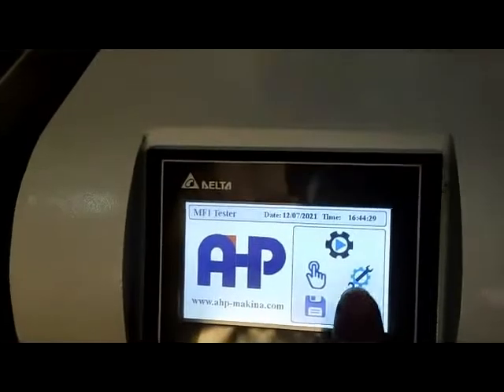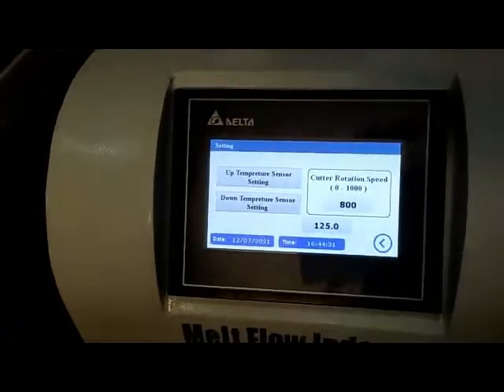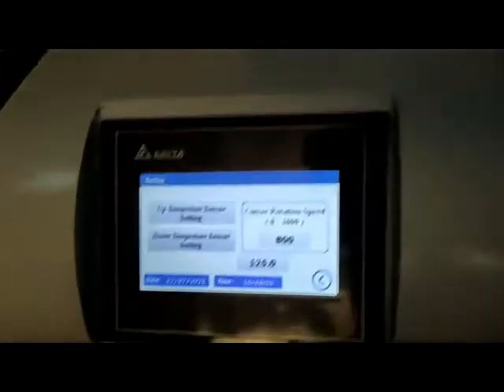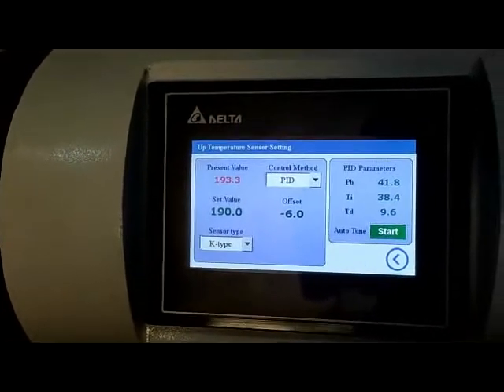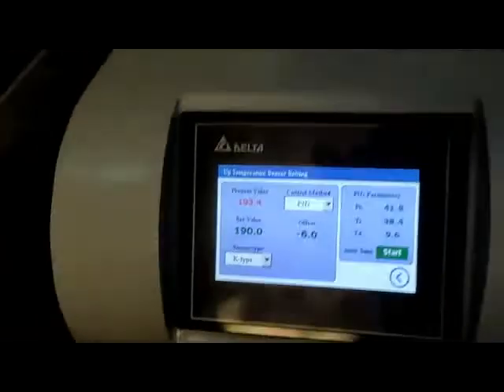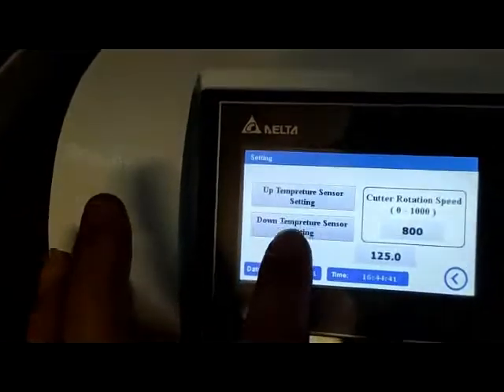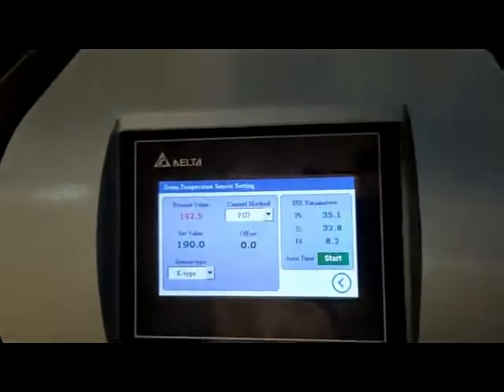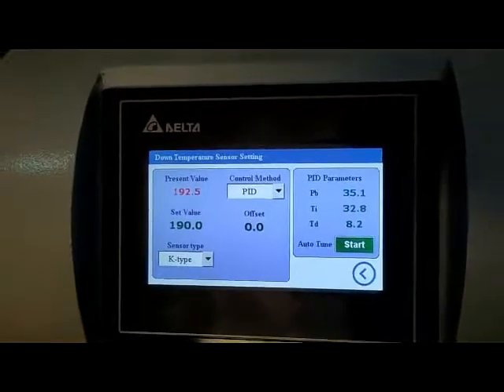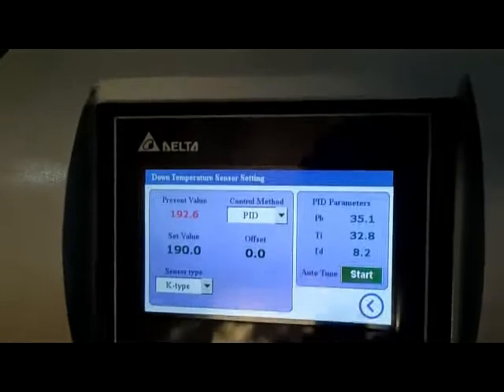In the calibration menu, you can calibrate the temperatures of the upper and lower sensors easily, and you can also tune the parameters of the controller from here.